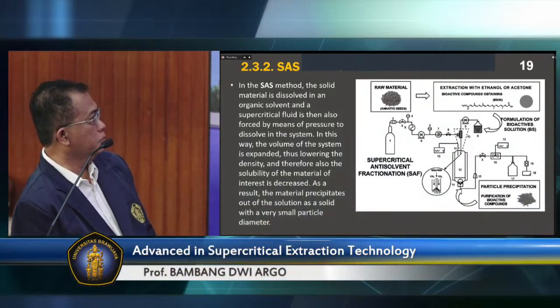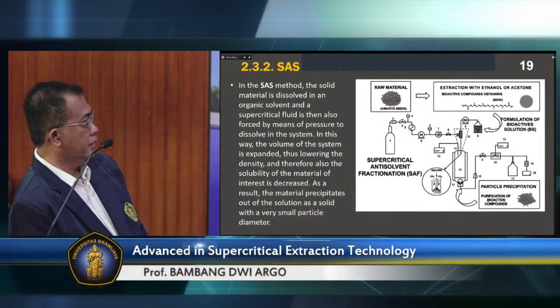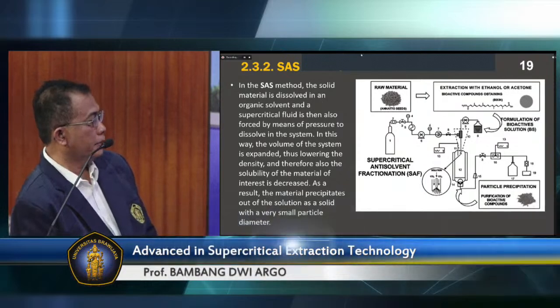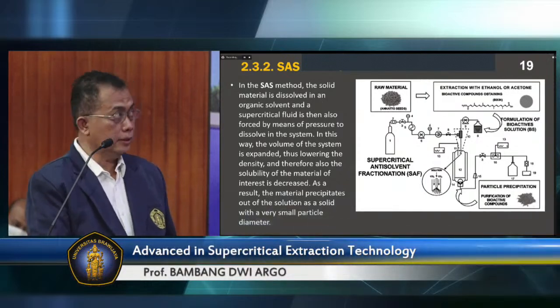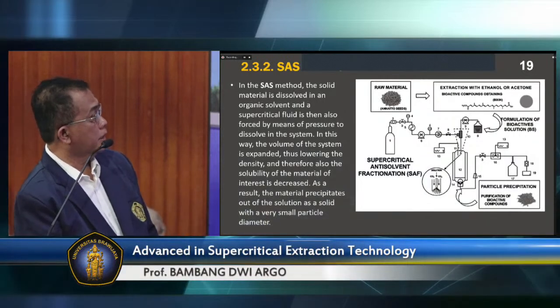This is important information. As a result, material precipitates out of the solution as a solid with a very small particle diameter. This is an explanation of the SAS method.